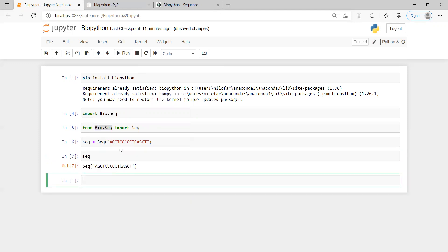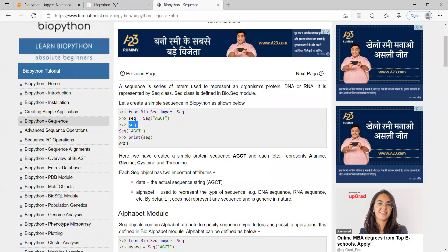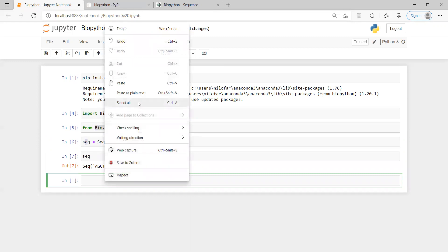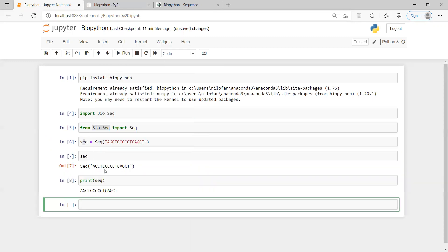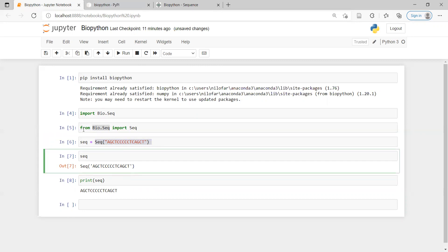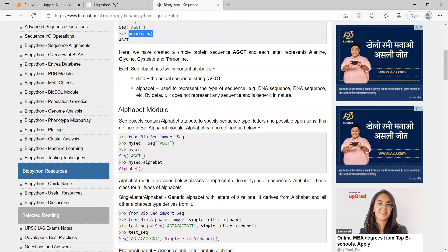Now you can see what sequences are present when you call the seq variable. Using BioPython, you can also use the print command to print the sequence. You can do it both ways — either print the sequence or just type the variable name. It will return the exact data assigned after the equals sign. This is how a simple installation of BioPython works, and the sequence can be called using 'from Bio.Seq import Seq'.